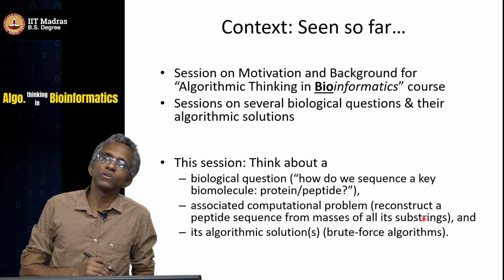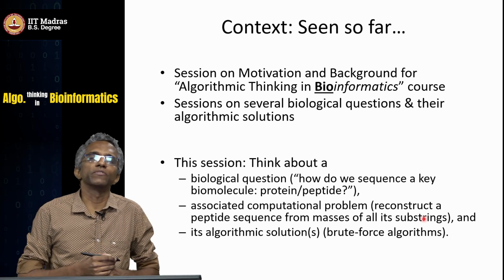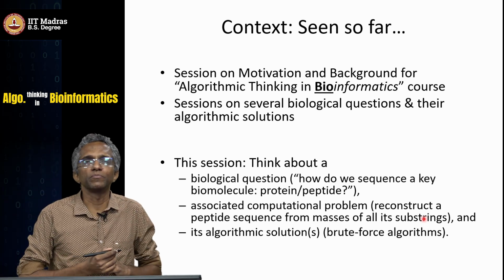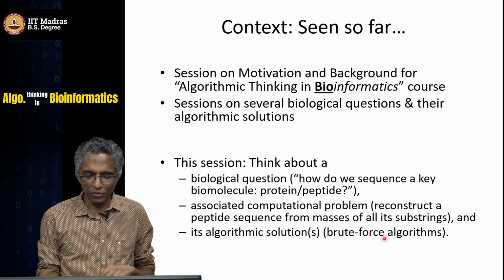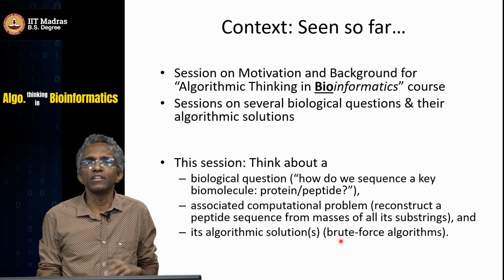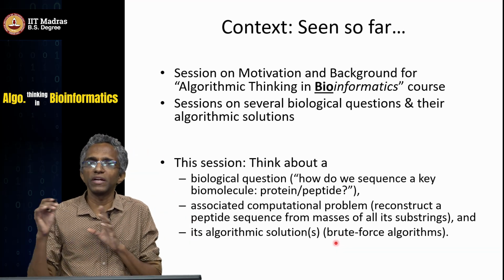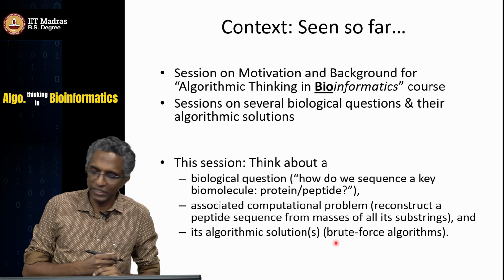We are going to look at brute force algorithms for it, exhaustive or enumerative types of algorithms, and maybe a little bit of branch and bound, so that we are able to figure out the peptide whose ideal spectrum matches the observed spectrum from the experiments. If you know the sequence, it will have a particular ideal spectrum.